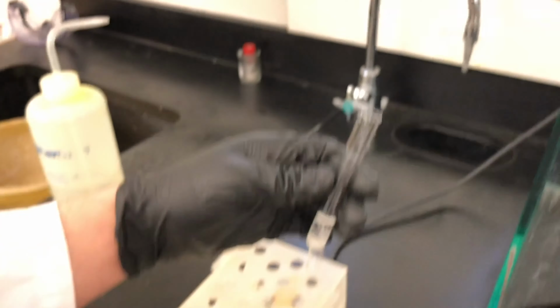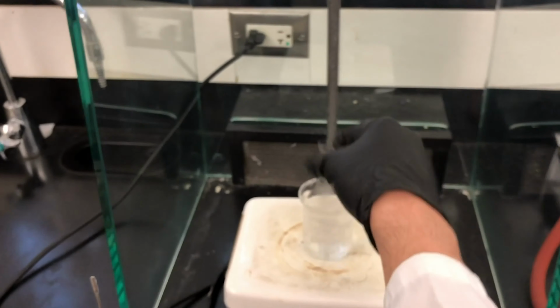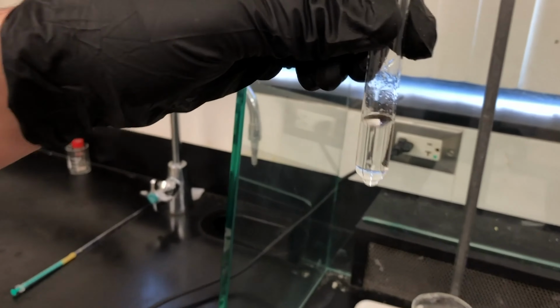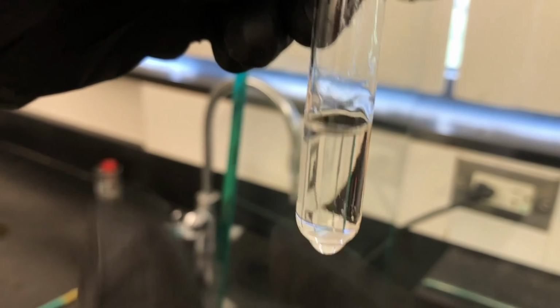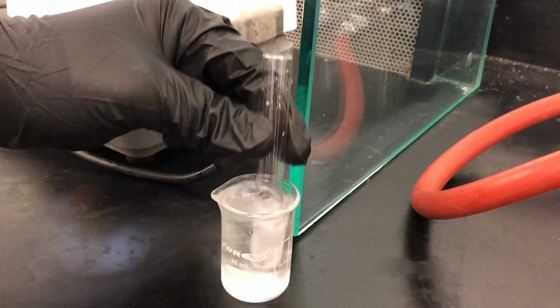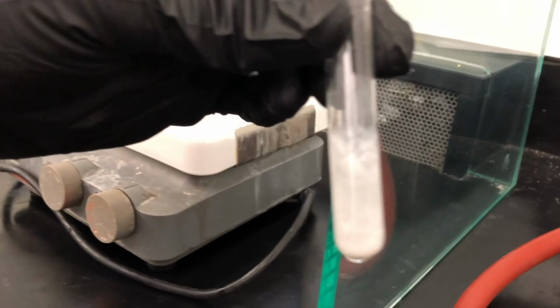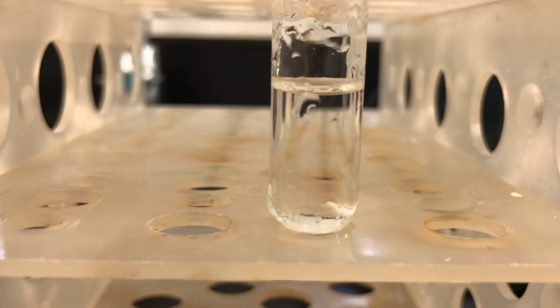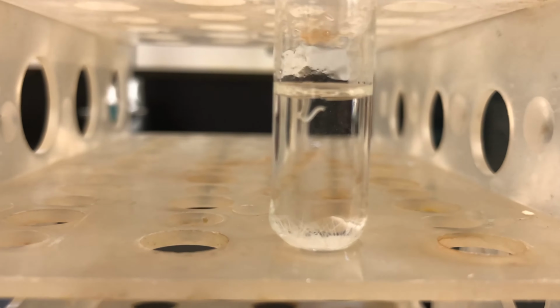After a few swirls, we add the minimum amount of hot ligroin required to dissolve the alcohol. Before adding more solvent, place it in boiling hot water, and this should dissolve it. Before recrystallizing at room temperature, place it in an ice cold water bath to ensure it precipitates out of solution. If it does not precipitate, this means we have added too much solvent and we need to boil it off. After it has precipitated, we can place it in the boiling hot water again, dissolve it, and then let it recrystallize at room temperature. Recrystallizing at room temperature allows the crystals to form correctly.